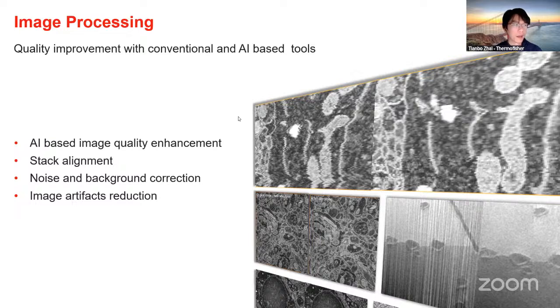So denoising can serve the purpose of giving us a good starting point. But again, you cannot overthink pre-processing, because there probably will be a certain limitation where you couldn't denoise further. That will be okay, because down the road there are still additional methods and components of the workflow that can support. I would say image pre-processing, you can consider as denoising or filtering, as straightforward as these two.